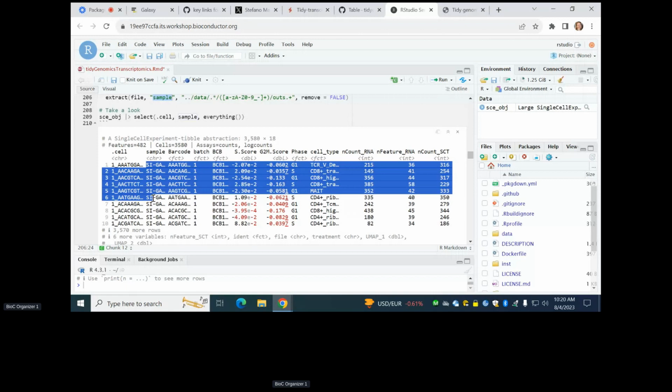Yeah. Is there a place where all of the implemented tidyverse are documented so we know what we can use? A place. Well, the package is all documented, but the documentation mirrors, for the most part, the tidyverse one. The application is the same. It's just plyranges. So again, are these just coming from plyranges? No. This what, sorry? Like select, mutate. From dplyr. Oh, okay. Yeah, so these are all functions that are included in the dplyr, tidyr, ggplot, and plotly. Right. So are these like S4 methods for those functions, essentially? No. Those are S3 methods we apply to.